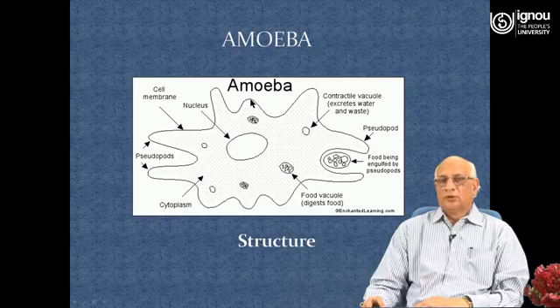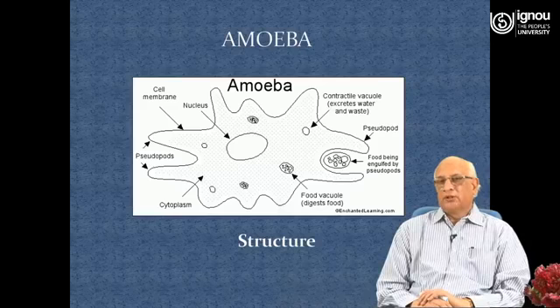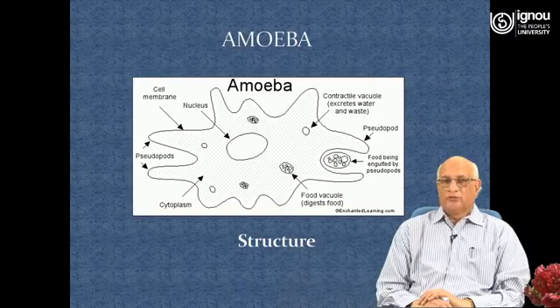So, that is how the animal is getting respiration. All these three animals, when they are living in aquatic medium, the process of respiration is almost the same. Through the pellicle they are getting the oxygen, and through the pellicle they are also transferring the CO2 from the protoplasm into the water medium.